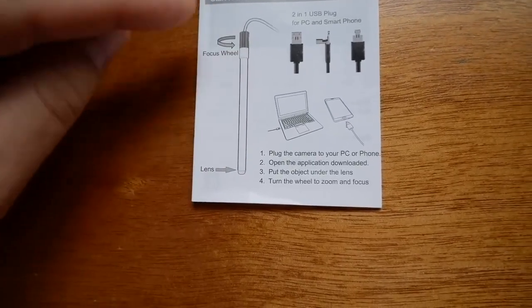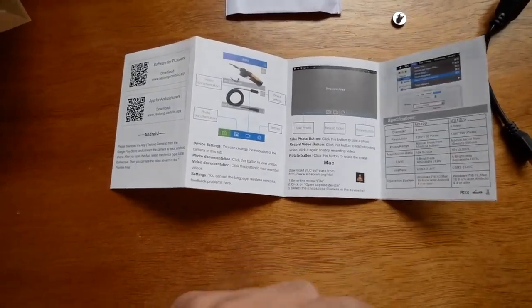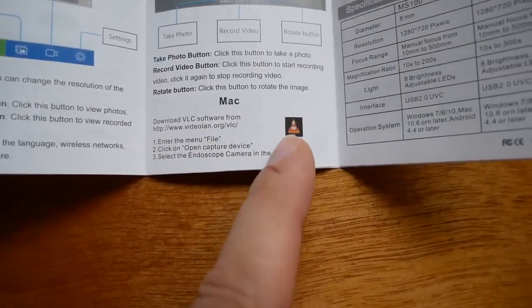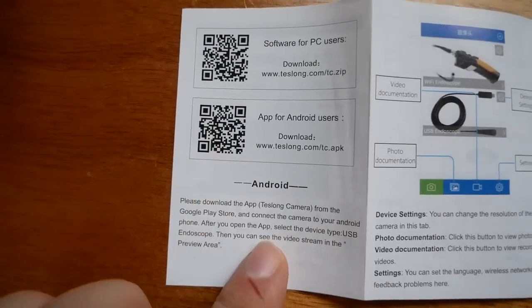It looks like we have the focus wheel on the very top of the rod, and the manual tells you how to use all the software and things like that. If you do have a Mac, you can download VLC to use with the scope. For phones, there's a little scan bar and they do have an app for that.